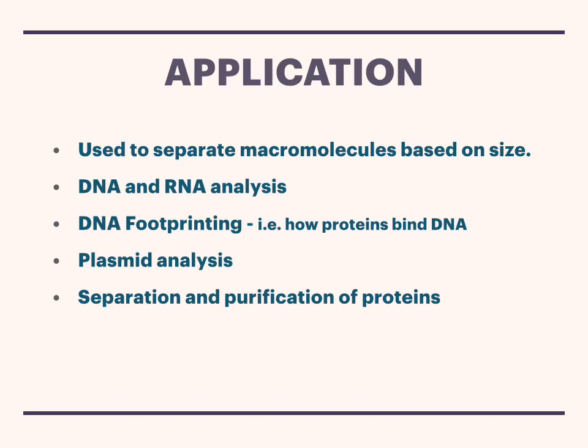Especially, it is used to separate macromolecules based on size. It is also used in analysis of DNA and RNA. DNA footprinting, a technique which is used to know how a protein binds to a particular DNA sequence. Plasmid analysis and separation and purification of proteins.